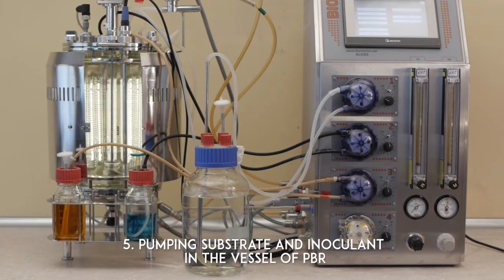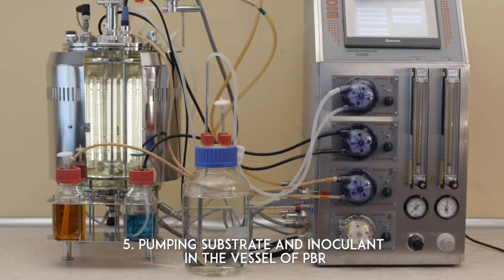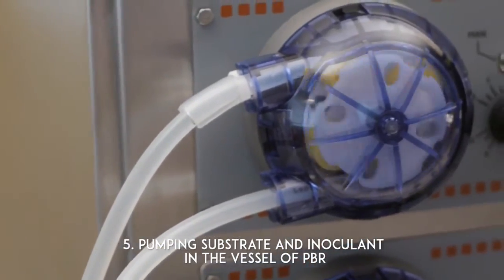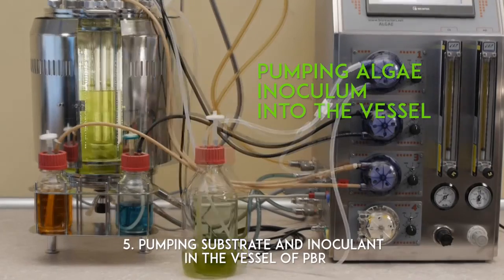Pumping substrate and inoculant into the vessel of the photobioreactor. Pumping medium into the vessel. A safe and handy way to add the culture medium and inoculant is by using peristaltic pumps. Pumping algae inoculum into the vessel.